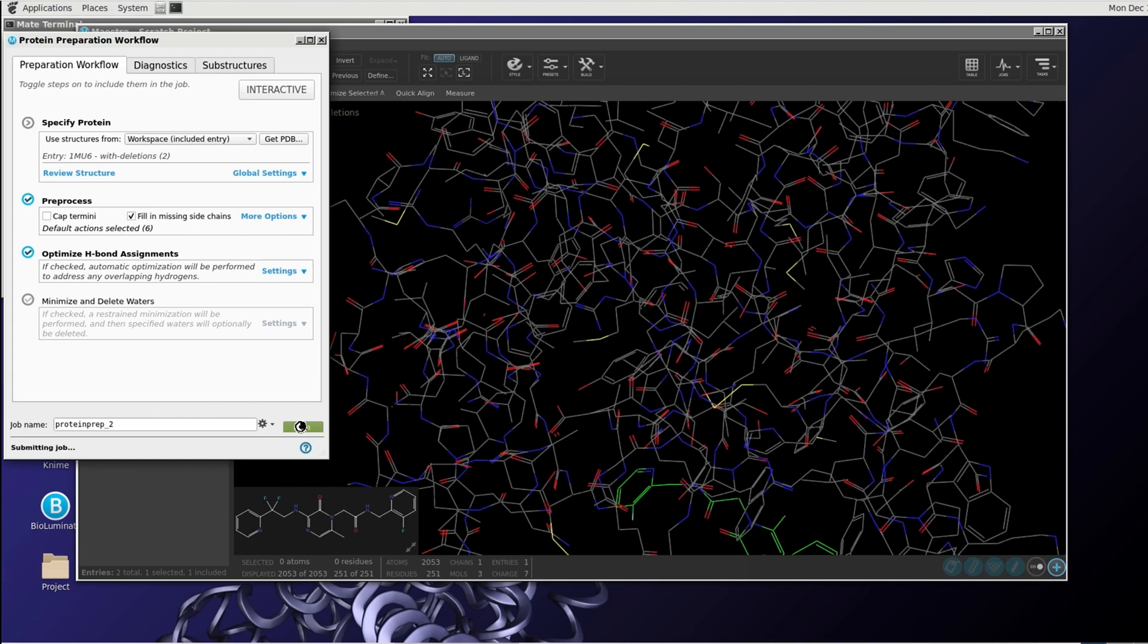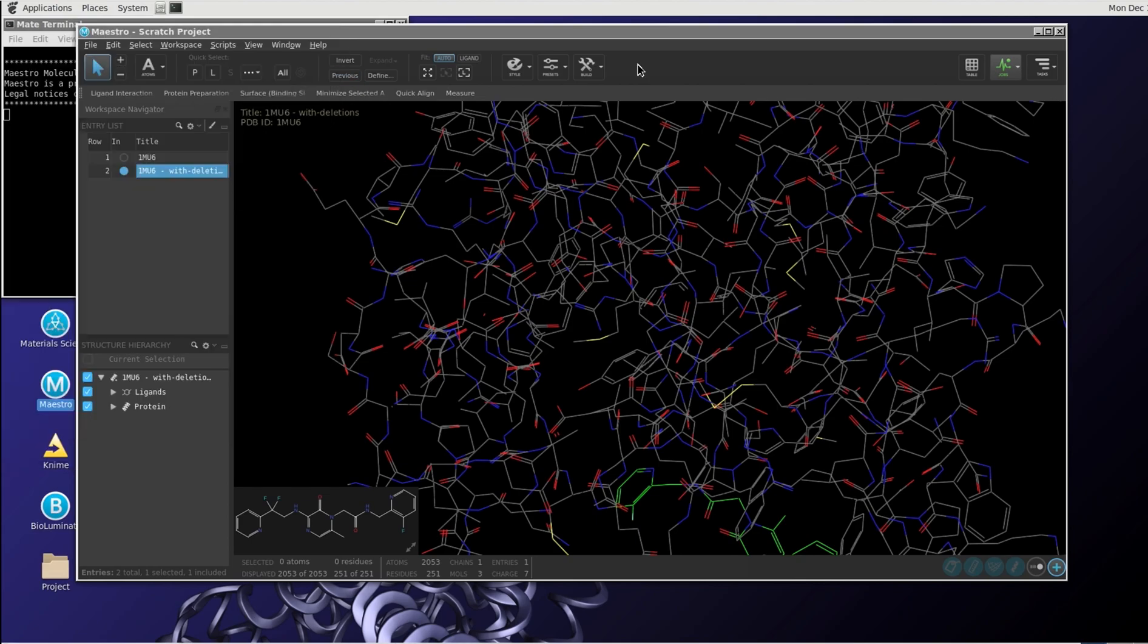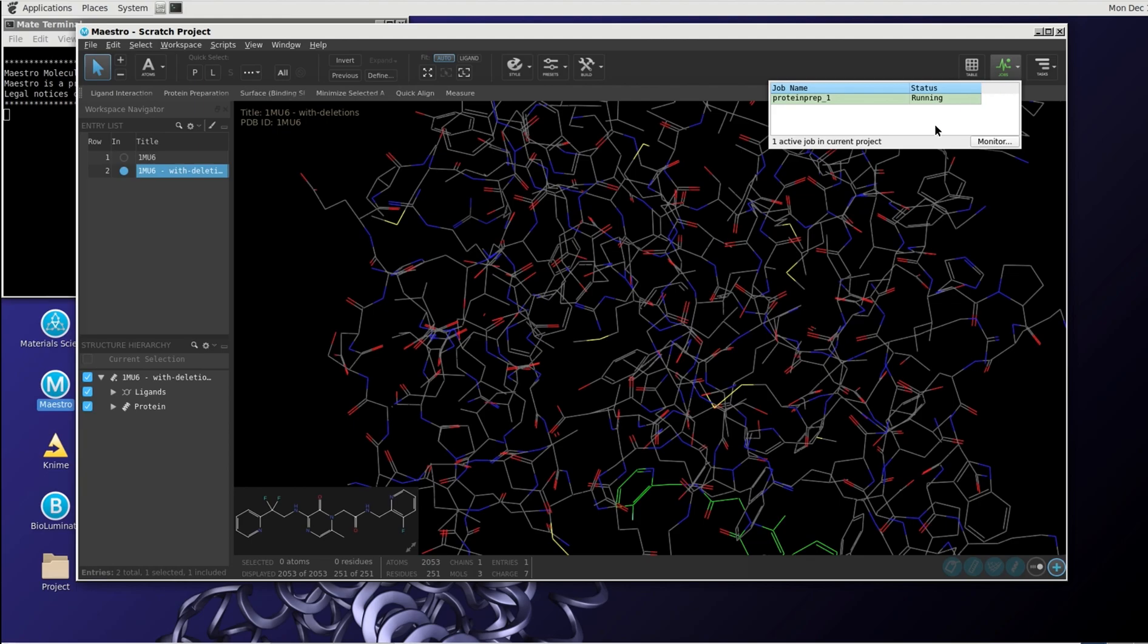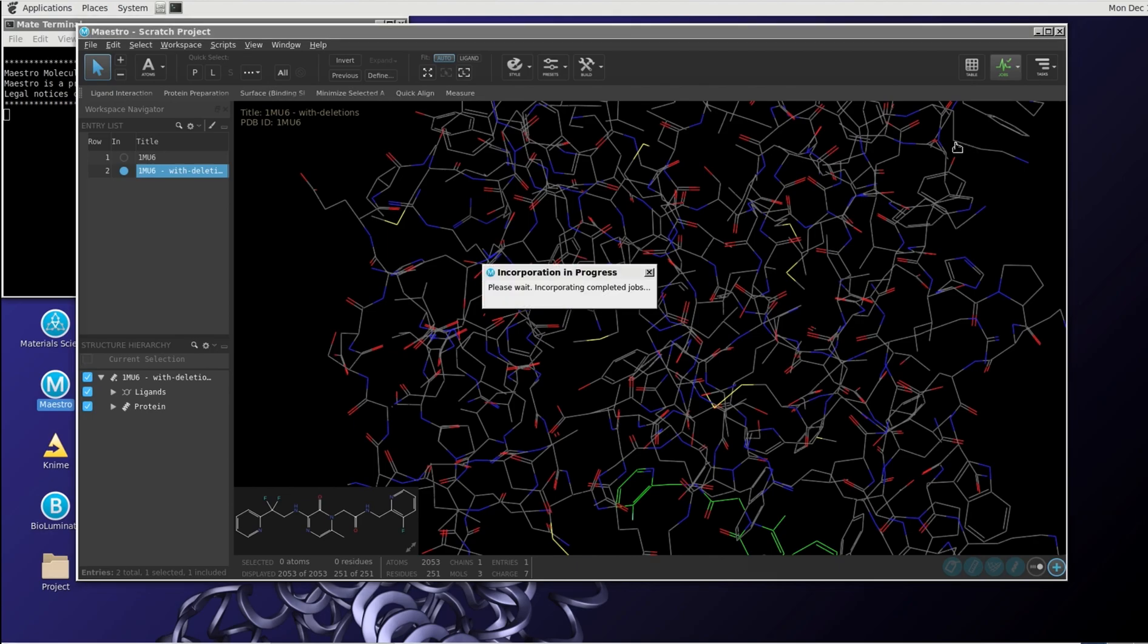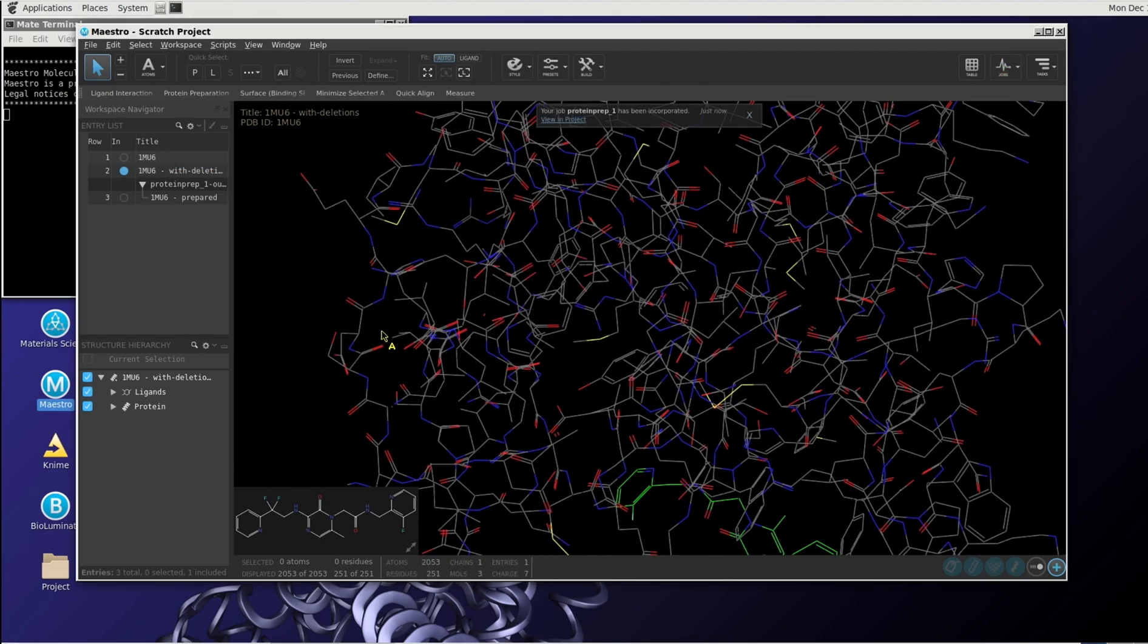We have to wait a little bit, I guess, once the job has been submitted. Job has been started. So we can close this window and we can follow the progress of this job by clicking the jobs button. Normally, when it's finished, it will be incorporated in the workspace and we can work further from there. It's already finished.